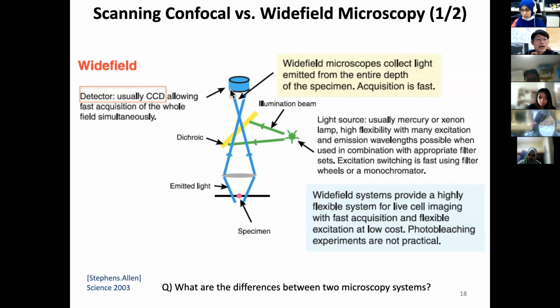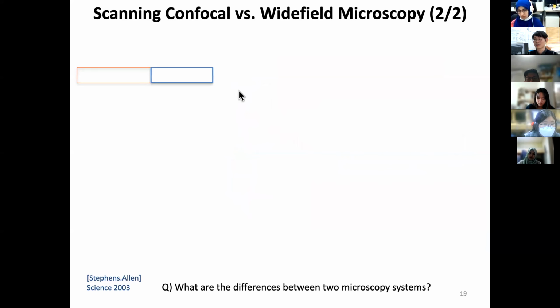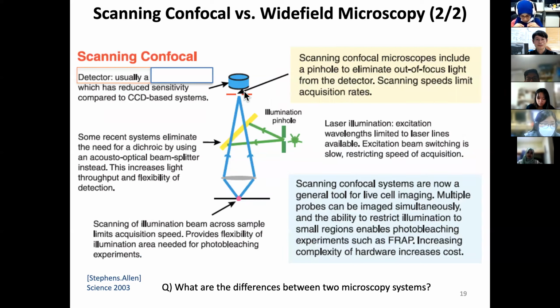But confocal, as you remember, is point by point scanning, with information only from a point. So you don't need a camera, in fact. You just need one single point detector in a confocal microscope, right? Because you are going through the pinhole, all the information you are collecting is supposed to come from one point. If it's a camera, it's a 1 pixel camera. And so you've got to use a very highly sensitive, fast, and good 1 pixel camera.